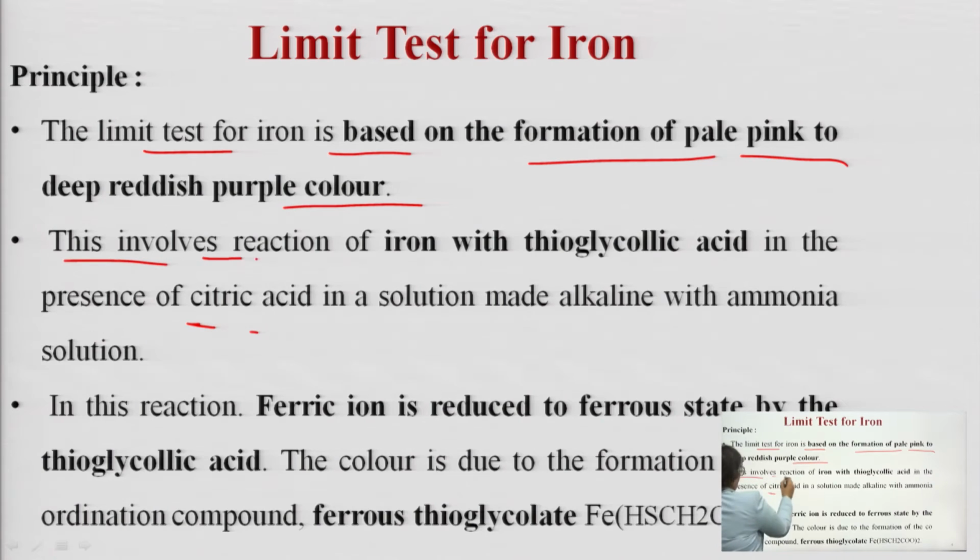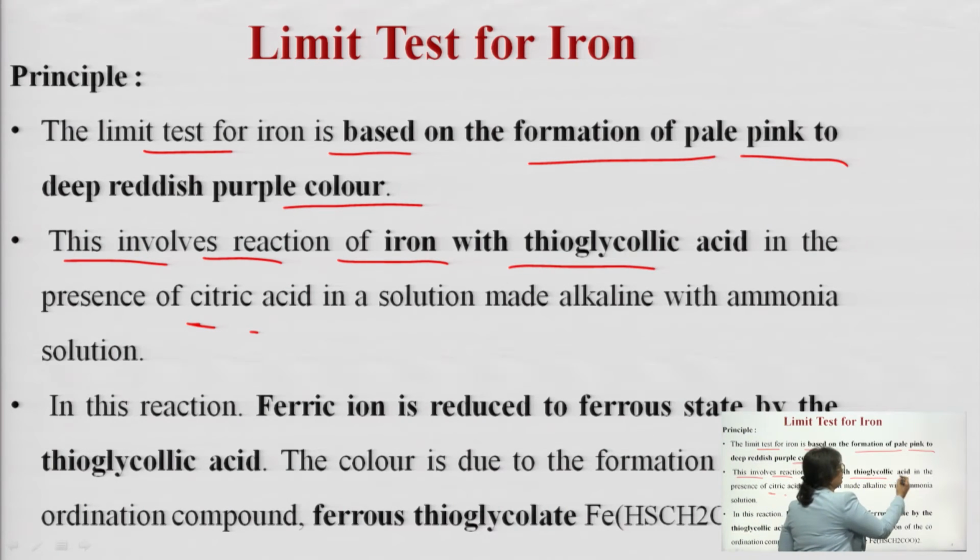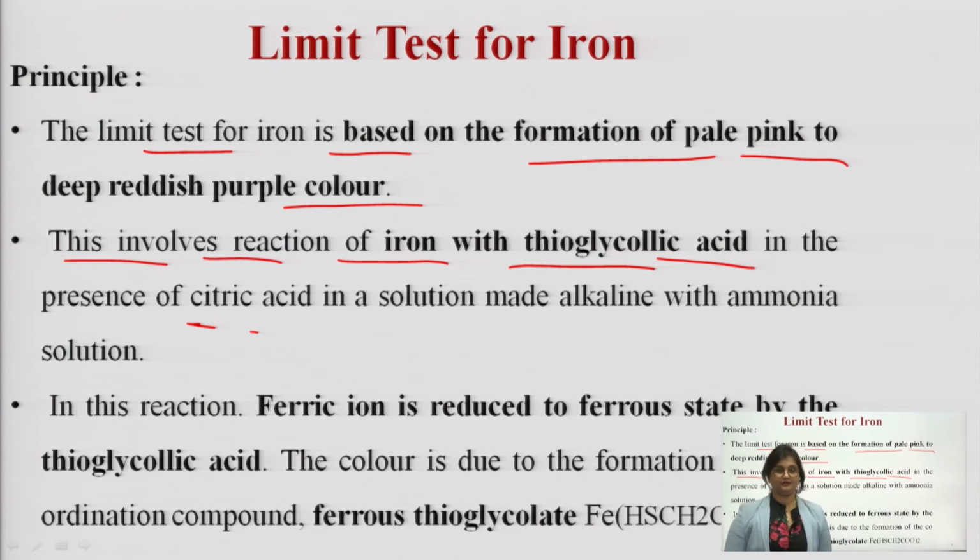Now, moving on, the limit test for iron involves the reaction of iron with thioglycolic acid.